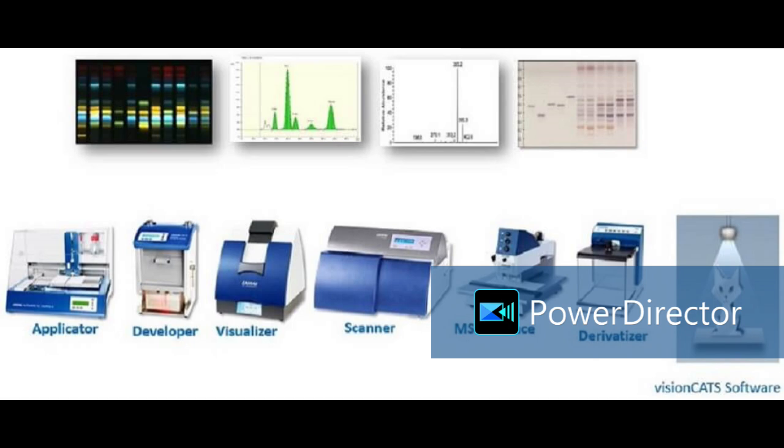This is rapid separation, detection and quantification of explosives. Explosives may be TNT, PETN, NG, tetryl, RDX, different explosives separated after derivatization with KOH and with diphenylamine. So calibration curves of RDX, quantification has also been done, not only qualitative work.